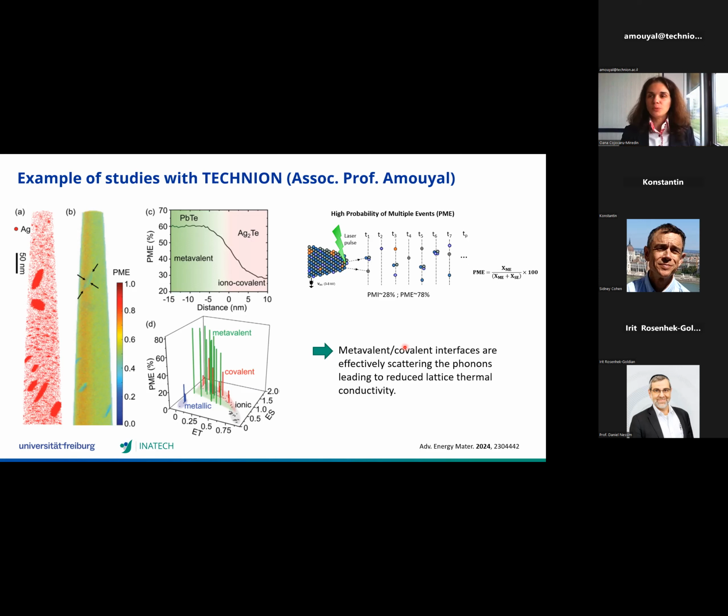And with atom probe tomography, in the last years when I was still at RWTH University, together with Professor Wuttig, we have seen that there are materials which have a very peculiar bonding mechanism, and we have called that metavalent bonding. If you look in the literature, many papers have risen up in the last years about this new bonding mechanism.